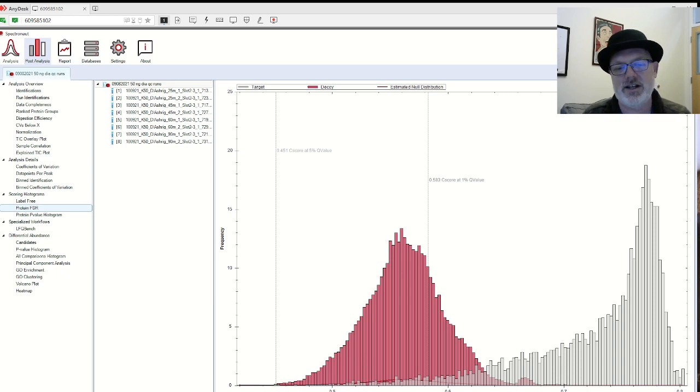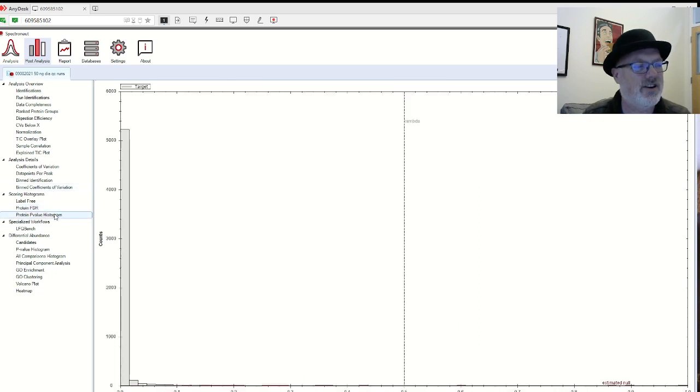So these are the decoys, this is the non-decoys, and we try to calculate where the example is. And you can see this might be an example of, you can filter by score. It's an interesting graph. I don't really know what this means. This seems a little into the red for me. I would think it should be out here, wouldn't you? I don't know. I'll still have to figure out what that means.